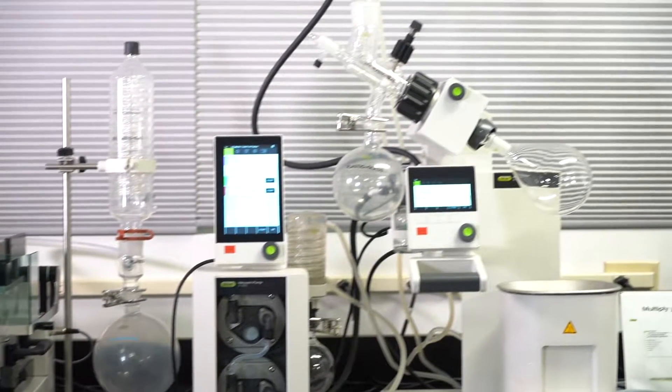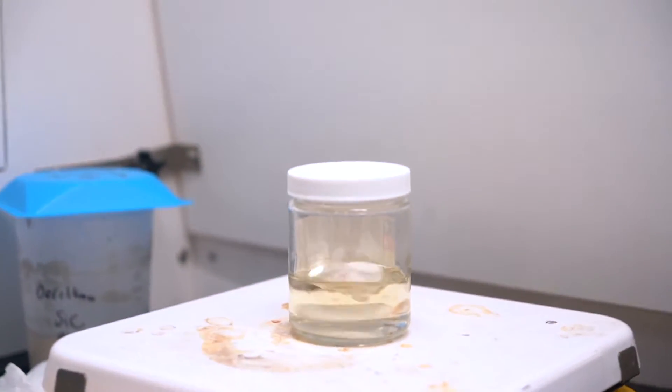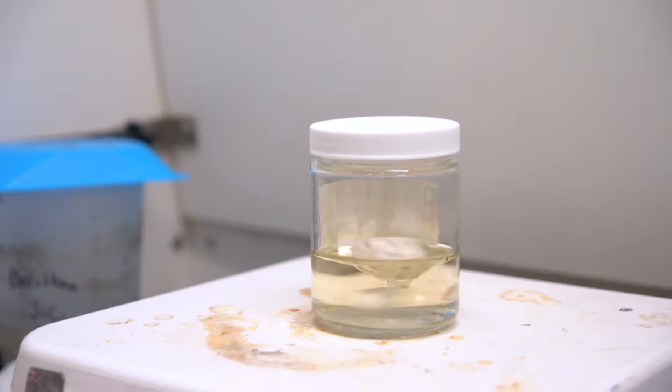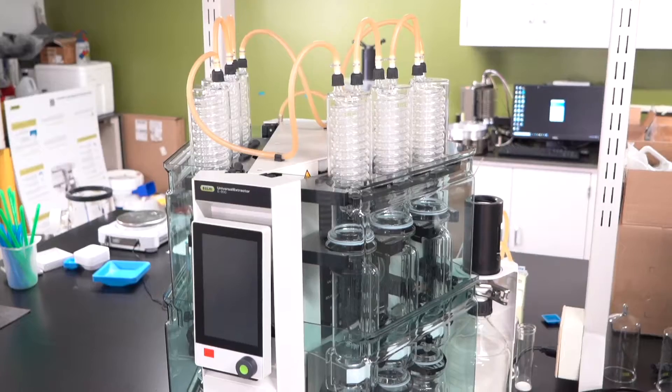For novel applications, Buki can coordinate a feasibility study where samples are sent to our lab by the customer to be tested directly on our instruments to show project viability. If the customer needs a live lab demonstration, you can connect with your Buki representative to coordinate lab time.